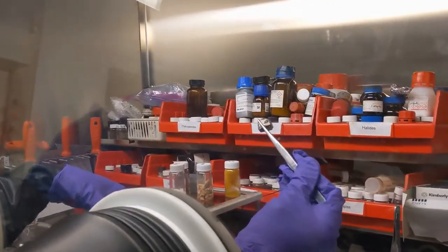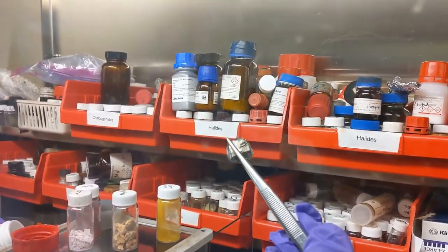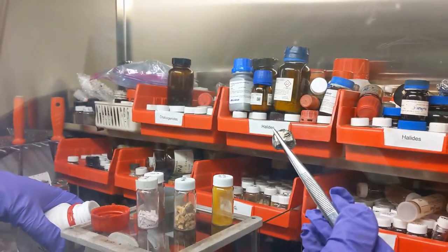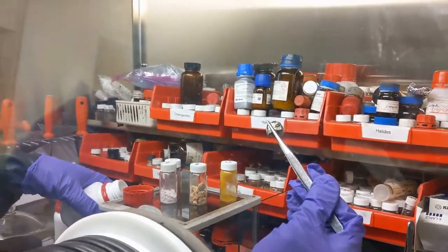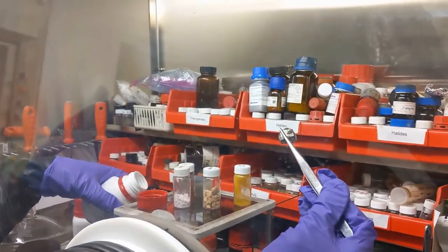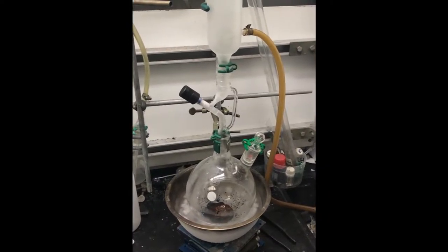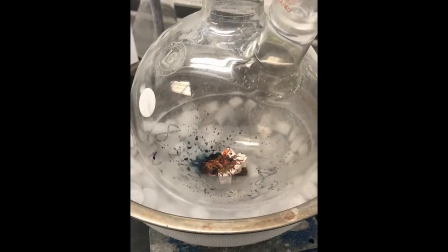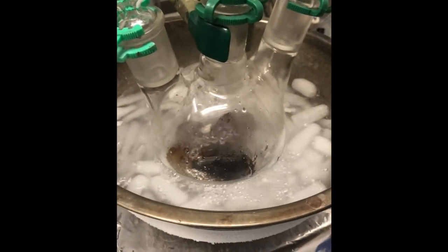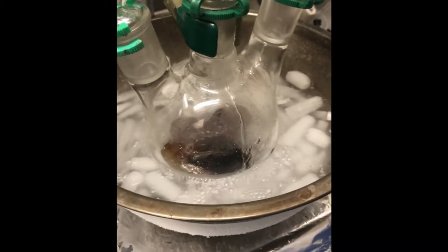Here Abhishek is handling a piece of pure barium. We also have elemental sodium, lithium, and potassium in oil in the glove boxes, so that we can run all sorts of alkali metal and alkaline earth reactions. One of the things that's really unique about our lab is we run ammonia reactions to target these alkali chalcogenide products, which are very hard to find in industry and very hard to make.